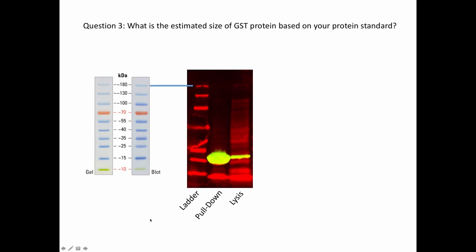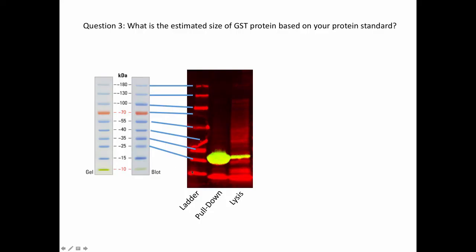So just draw lines across. This is the very top band you see there, is 180. This next band is 130 kilodaltons, next one's 100. Now if you have a bubble in your ladder like this, this is going to be tricky, you kind of have to estimate. The 70 KD, there's a band that's faint right here, I'm going to call that the 70. The 55 is this band in the middle that you can see that's really weird. The 40 is actually this band that's kind of angled down but you can see these three bands so you know that these correspond to the 70, 55, and 40. Next is the 35 kilodalton band, the 25 kilodalton band, and then the very last band we see is this 15 kilodalton band here.